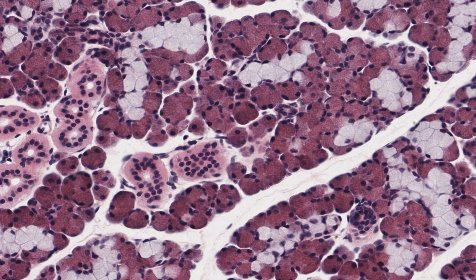As you now recall, their basophilia suggests vast quantities of granular endoplasmic reticulum and ribosomes, and indeed this cell type makes enzymes for export in a watery secretion.